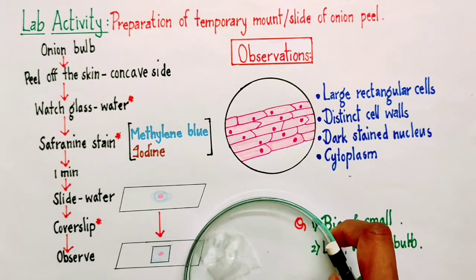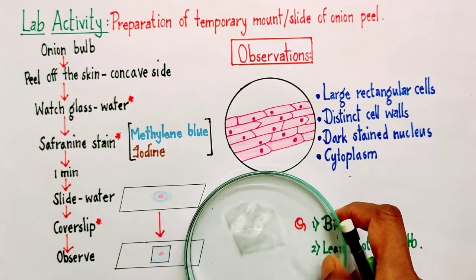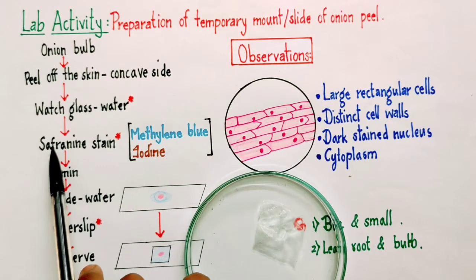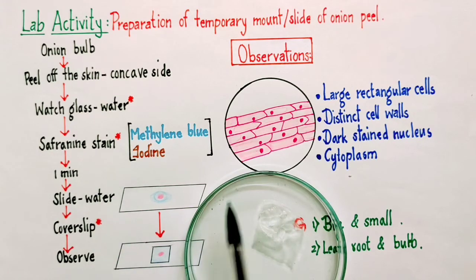That's the reason we have to immediately transfer this peel into a watch glass containing water. I didn't have the watch glass, so I have transferred it into a petri dish containing some water. Now the next step is we need to add a drop of safranin stain into this. Now why we need to add the stain?